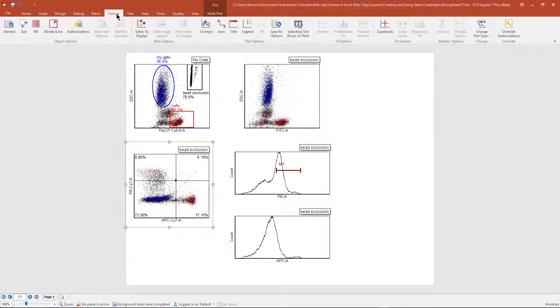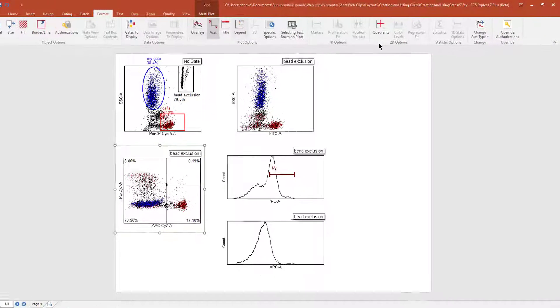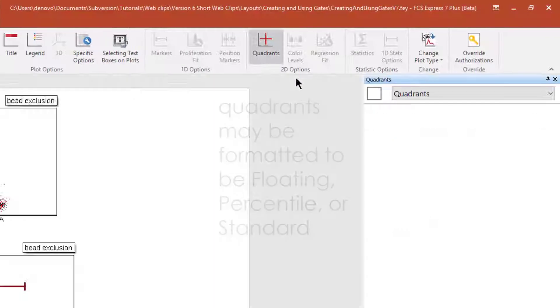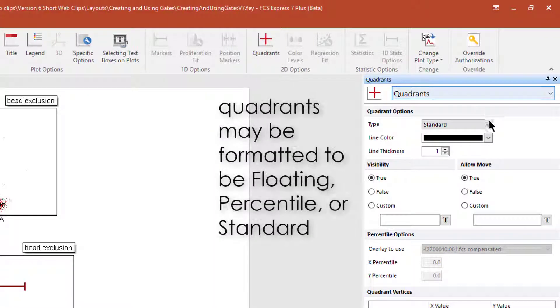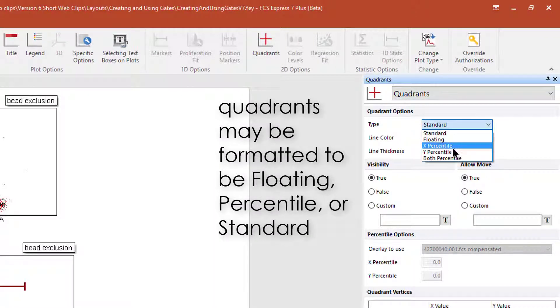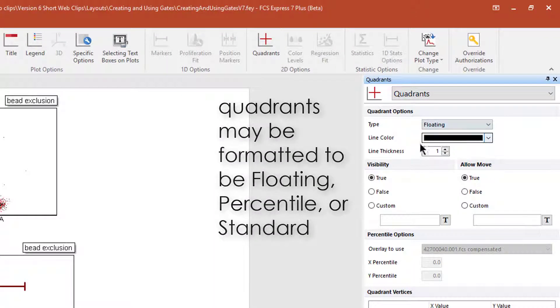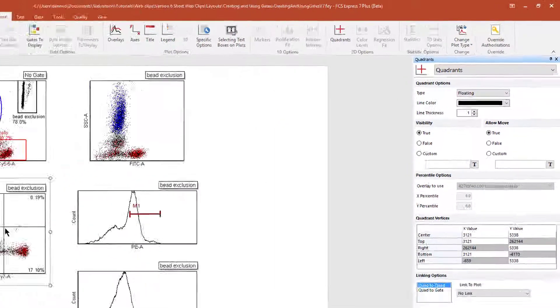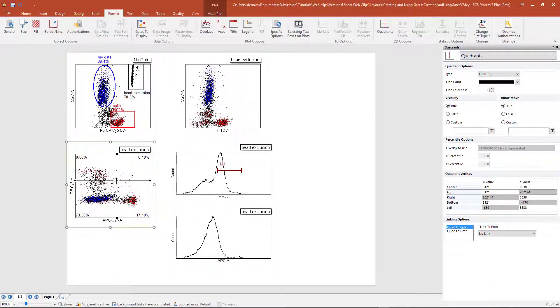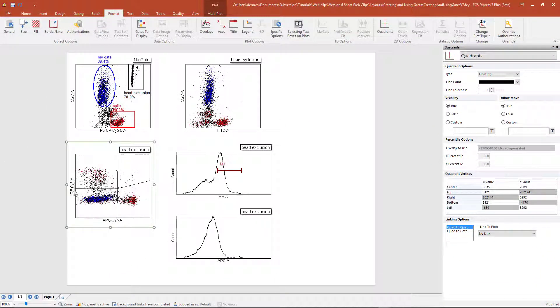Quadrants can additionally be formatted to be percentile, x, y, or both, or floating. With floating quadrants, you can move around each vertex individually to better fit your population.